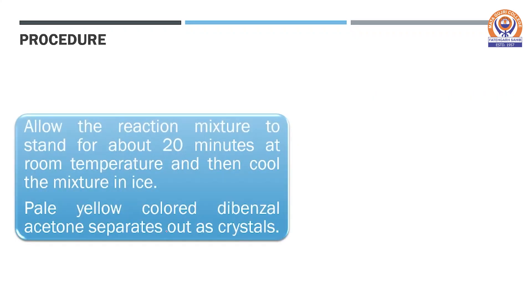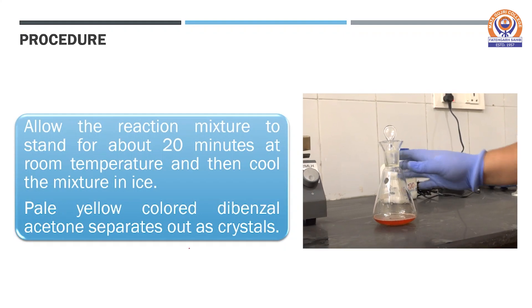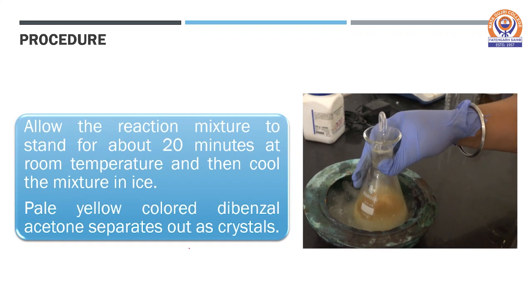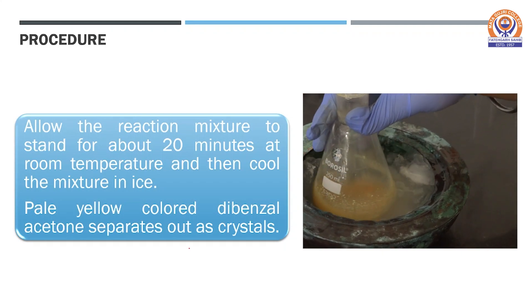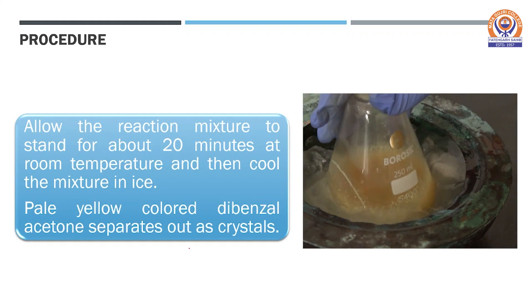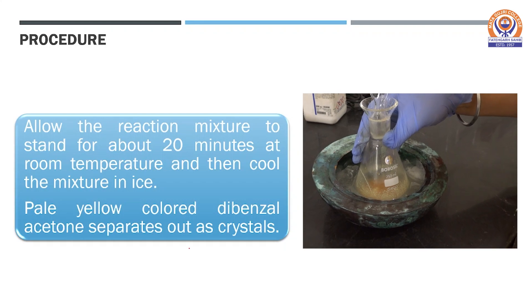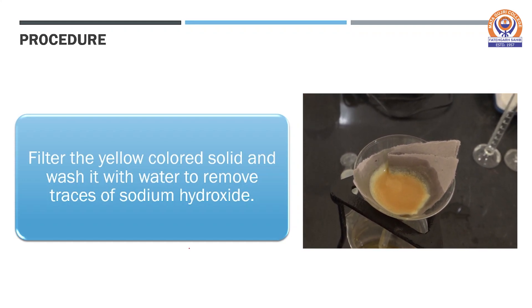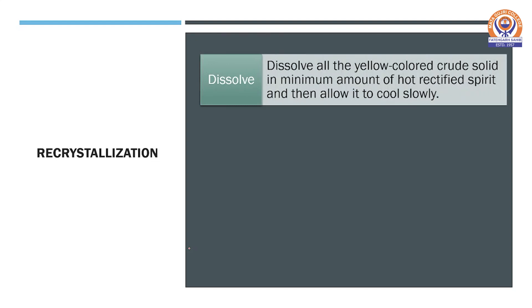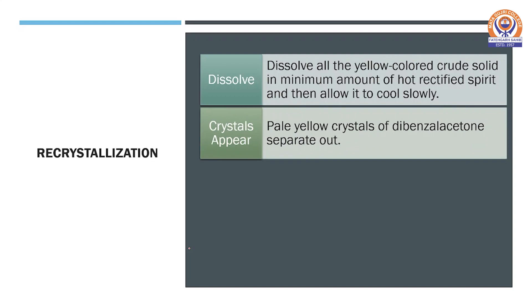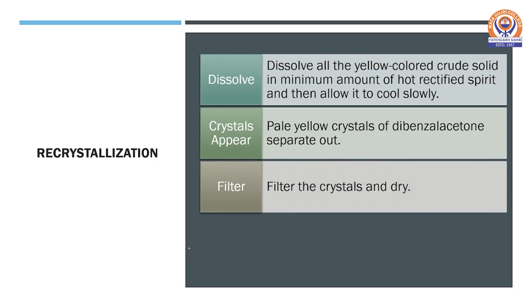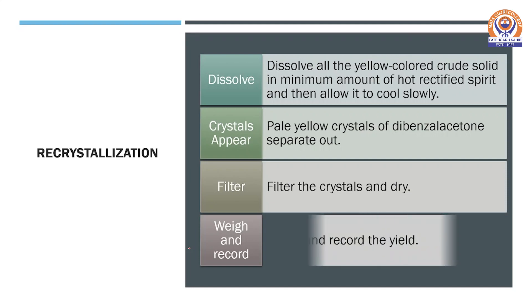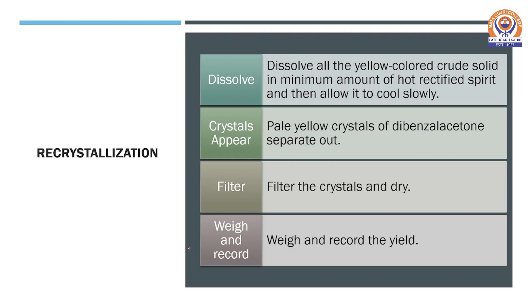After shaking is complete, allow the reaction mixture to stand for about 20 minutes at room temperature, then cool the mixture in ice taken in a water bath. Pale yellow colored dibenzal acetone separates out as crystals, as shown in this video. Filter the yellow colored solid and wash it with water to remove traces of sodium hydroxide. The obtained product is crude and may be recrystallized by dissolving it in a minimum amount of hot rectified spirit and allowing it to cool slowly, whereupon pale yellow crystals of dibenzal acetone start separating out. Filter these, dry in the folds of the filter paper, and weigh and record the yield.